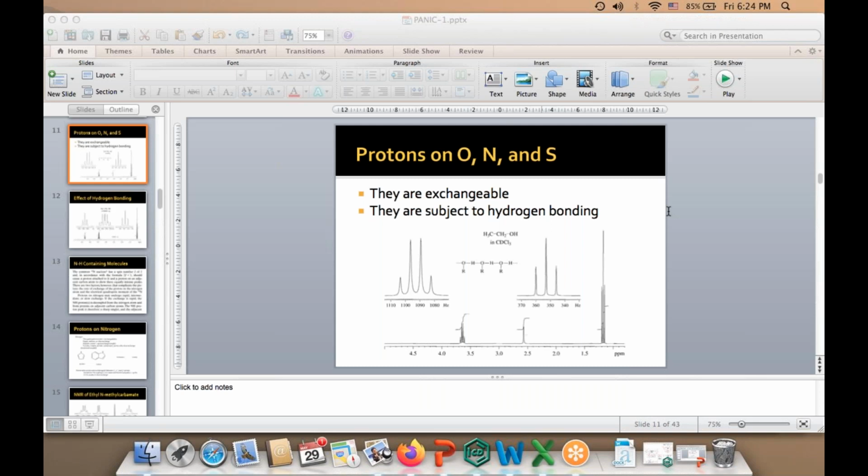Not all solvents have TMS, only a few do. But how you choose a base peak is, as I said in my first few slides, every solvent has an impurity, which is its protonated form. The hydrogen form is CHCl3. So the base peak in those NMRs is CHCl3, which shows up at 7.24 or 7.26.